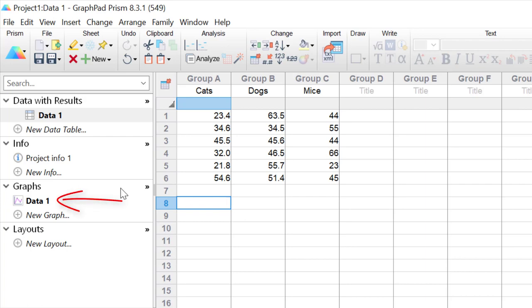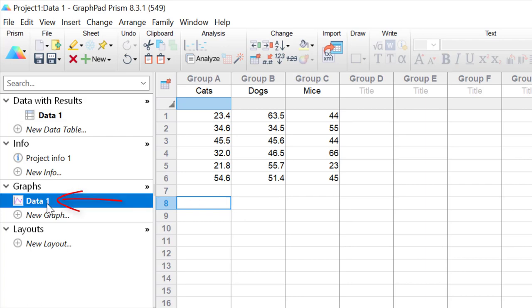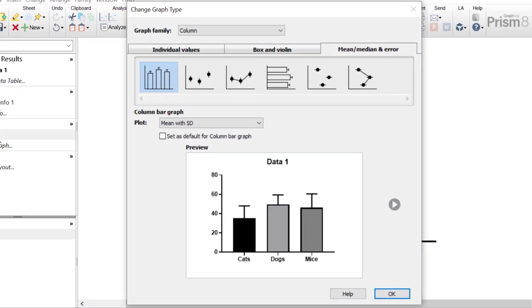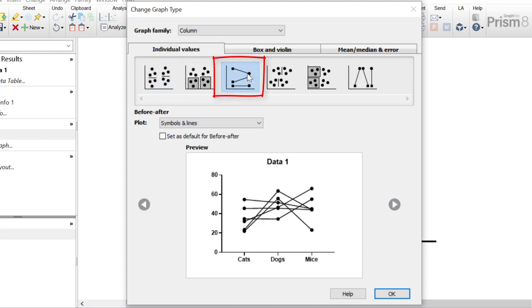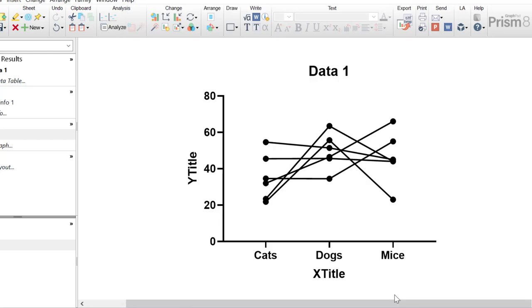To create the graph I'm going to click on the connected graph sheet in the left-hand window. In the graph wizard I'm going to select the individual values tab under the column graph family and select a before and after plot, then click the OK button. So this is the basis for our before and after plot.